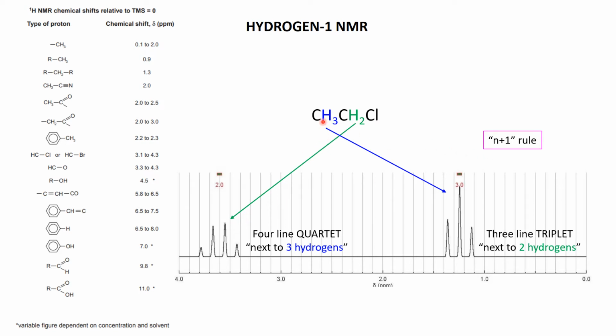And this hydrogen is on a carbon next to a carbon that has 2 hydrogens, so that splits into a signal with 3 bits, a triplet, because it's 2 + 1. Now that's really tough to get. Some people it clicks immediately, other people it takes a little bit longer. So I keep emphasizing this N+1 rule as we go through.